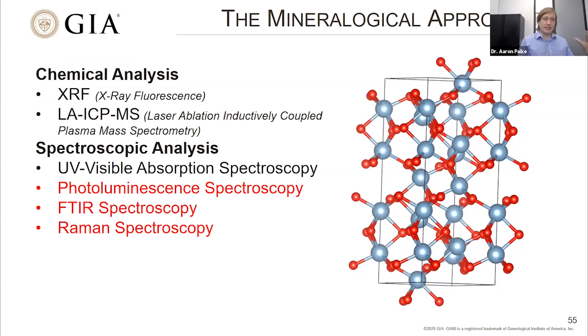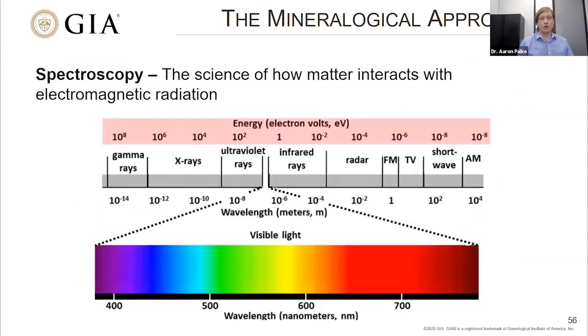Now that's the trace element chemistry analysis. I'm going to finish off with a few more spectroscopic analyses that we use in the lab before taking some questions from you guys. So I'm going to look at FTIR spectroscopy next.